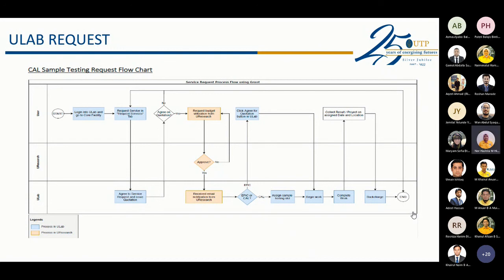Okay. Up to how many compounds can we select for the peaks? What's the cutoff of picking compounds? There's no limitation. Especially for samples from the geoscience group, you will have many crystals available in your sample, and the percentage of each compound is very small.